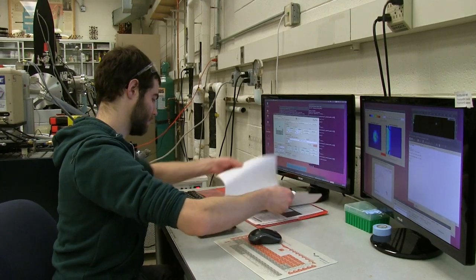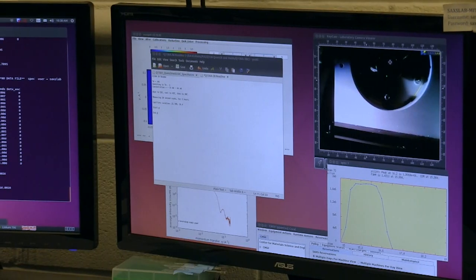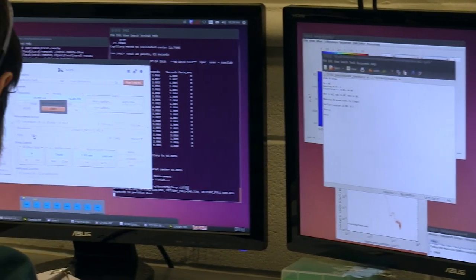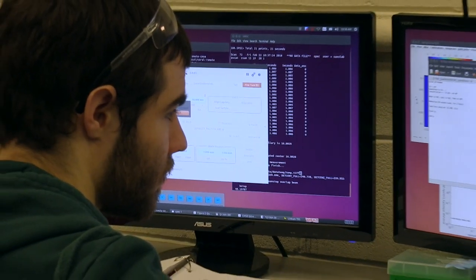I wrote a program that will heat the particles to different temperatures, and I will use the SAXS to monitor the crystallinity in situ. This will let me make insights into the molecular behavior of the system as it crystallizes.